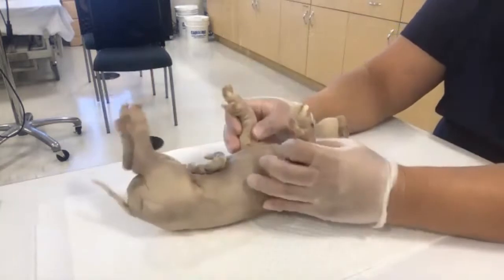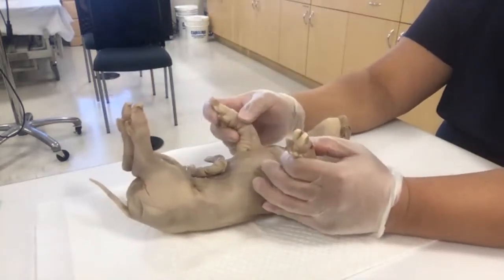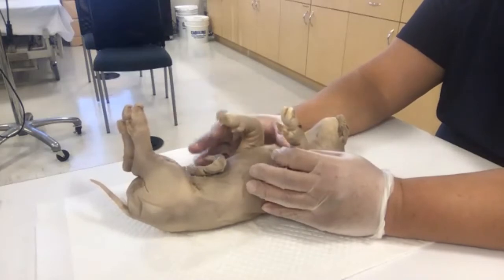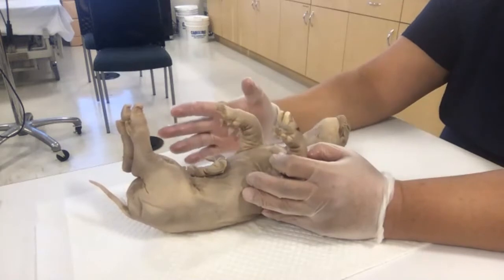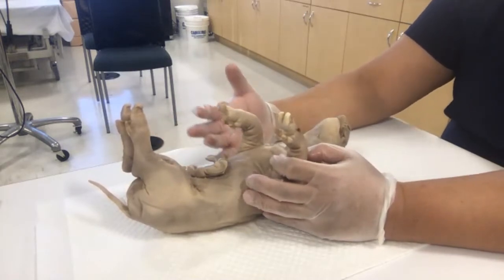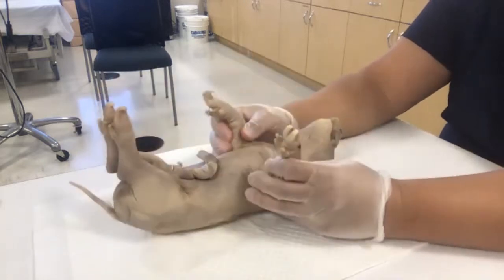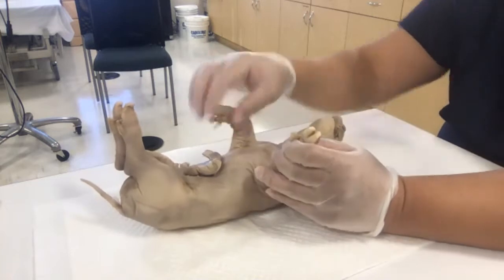So the first thing we're gonna do, as you saw in the little booklet here, is the beauty of doing pig dissection: the fetal pig has a lot of things that are very, very similar to a human being. Now we can't afford a real human being, like a cadaver, right? And it's also big. Where am I gonna store that thing? Right here, you got a little Miss Piggy. We could put it here, and these are fetal pigs.